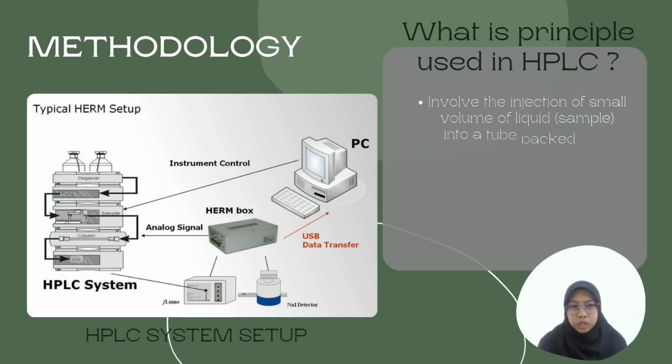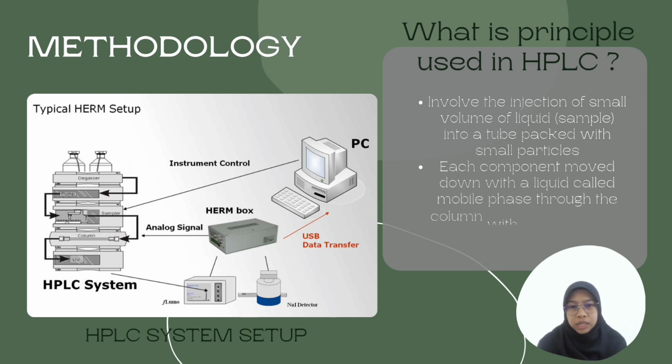Hi and Assalamualaikum. My name is Nur Sharafana binti Abdul Jaffar and my student ID is 2021631078. What I will present to you is my part, which is the methodology of the HPLC experiment. Firstly, what is the principle of HPLC?